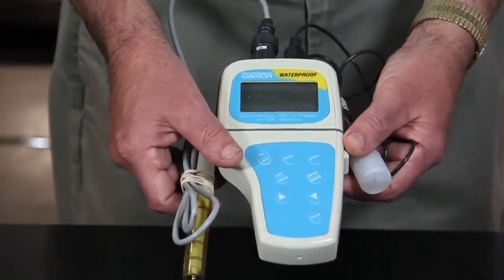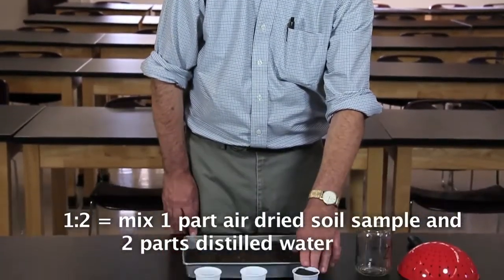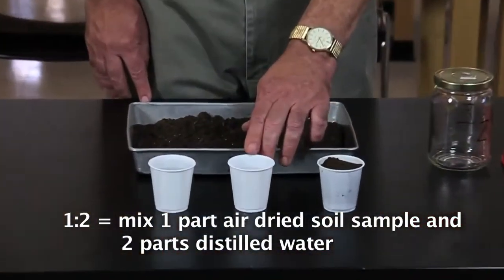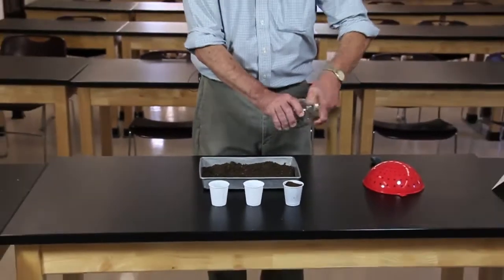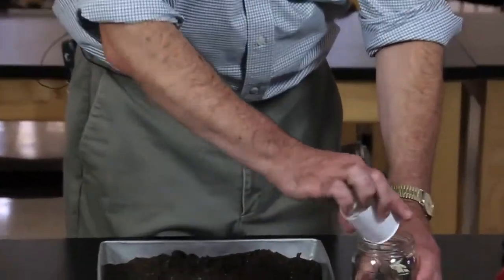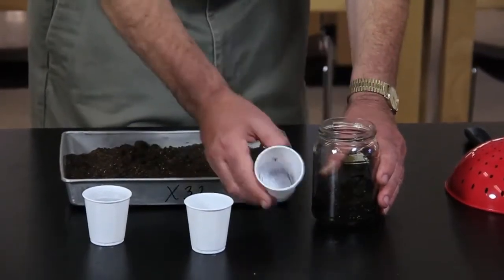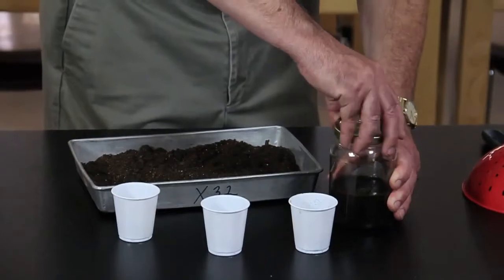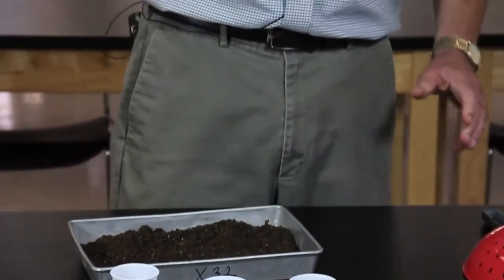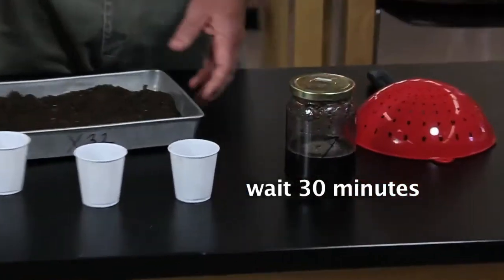A meter like this would cost maybe two to three hundred dollars. The one-to-two test is called the one-to-two test because you mix one part of air-dried, sieved soil with two parts of distilled water. Use your pickle jar — you add the soil, add the water, add the last cup of water, put the cover back on tightly, shake it up so that it's mixed up real good. Then you set it aside for half an hour and then you do the filtering process.